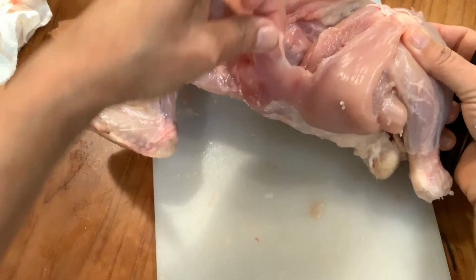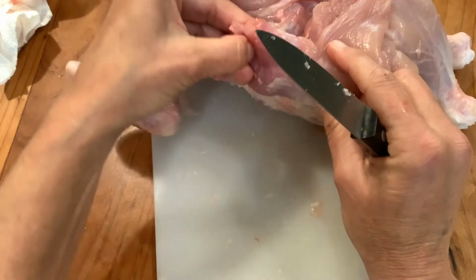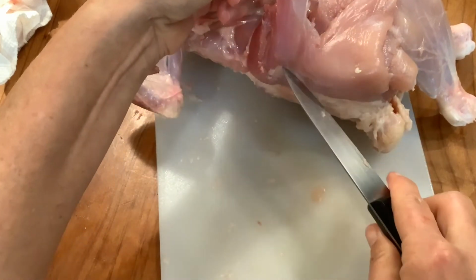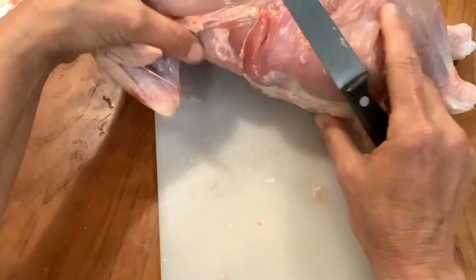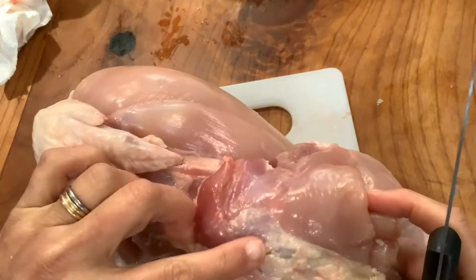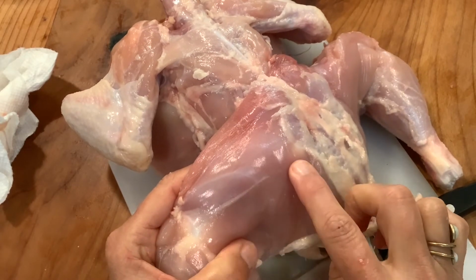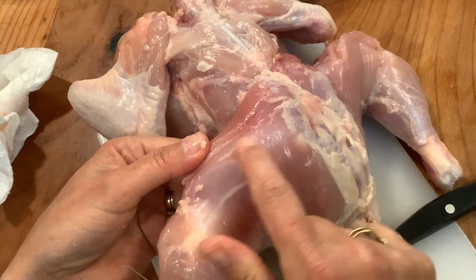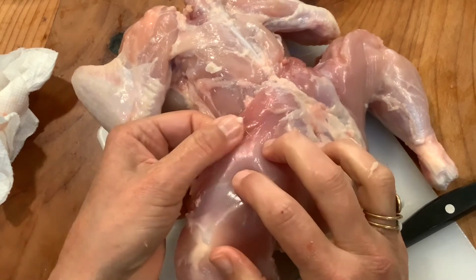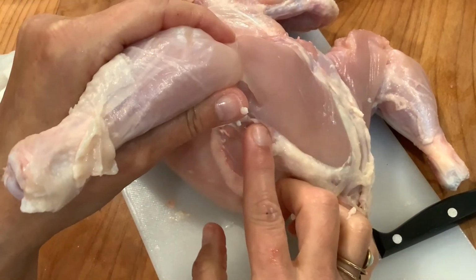The IT band, this kind of crescent moon shaped one is the tensor fascia lata. That's at the top of the IT band. And you can see this little circular area. If I could pick off this connective tissue, that would probably be the gluteus medius right there. On this side, it hasn't been dissected. You can see the little line. That's the edge of the biceps femoris. That's next to this white shiny stuff. That's the iliotibial tract. And you can see a little bit of a line along the bottom boundary.